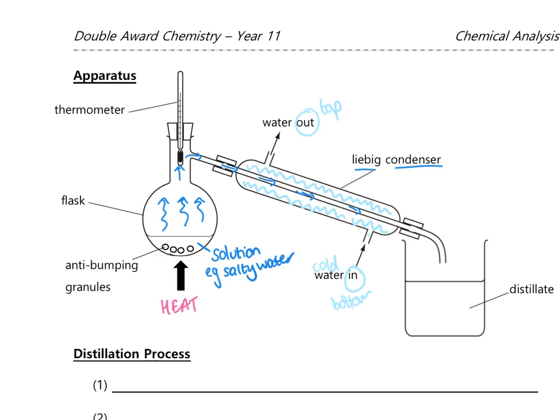So the steam is passing through the toilet roll as such, and the cold water is passing through that gap in between the toilet roll and the kitchen roll. So if we were to cut it down the middle as such and look at it face on, the steam would be passing through this inner tubing and the cold water will be running along the outside. They never mix.